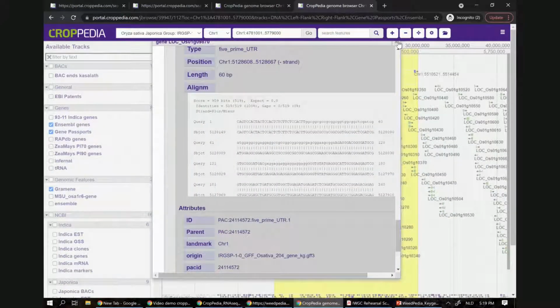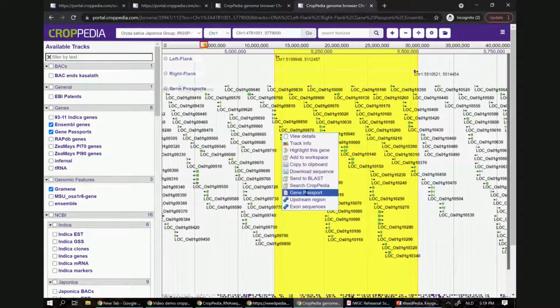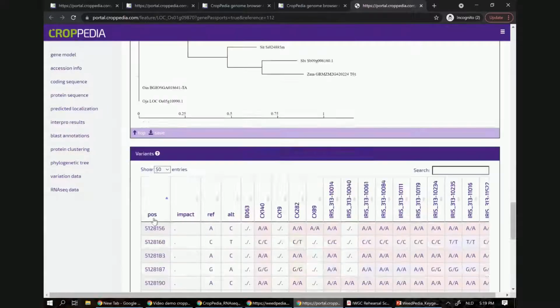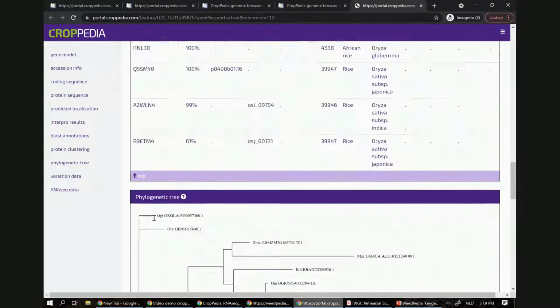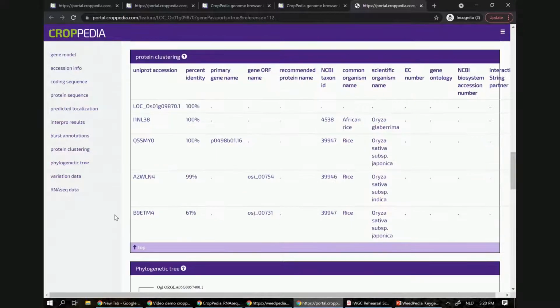And then again, look at the gene passport, look at all the information that you have, and decide whether this is of interest, yes or no. And this is a tedious process because there's a lot of data in there, and Pedia will not directly give you the answer. It's basically you who need to find that answer by the means of Pedia.